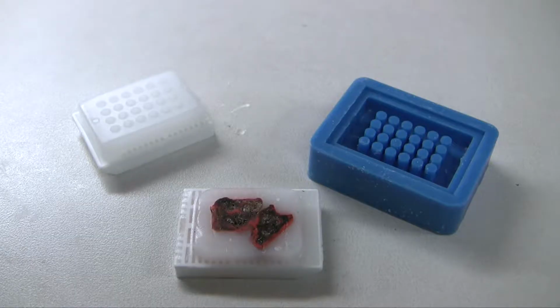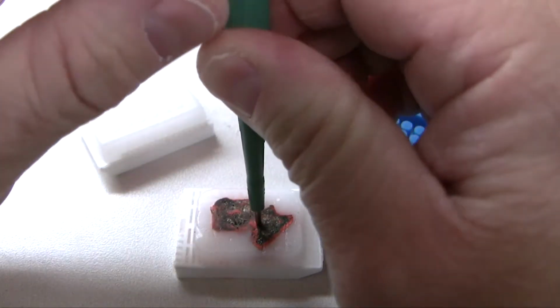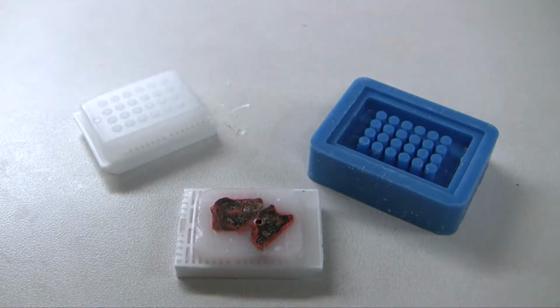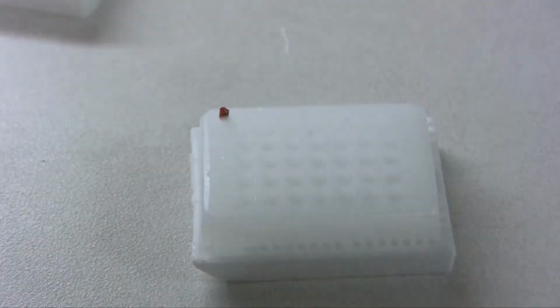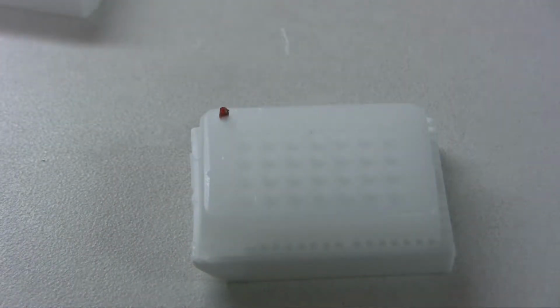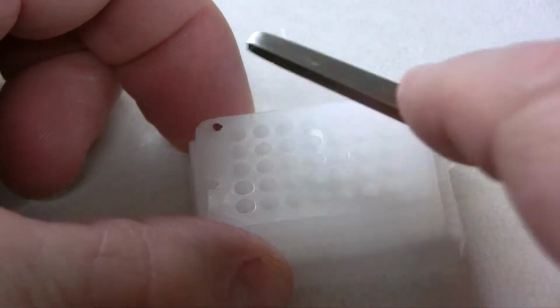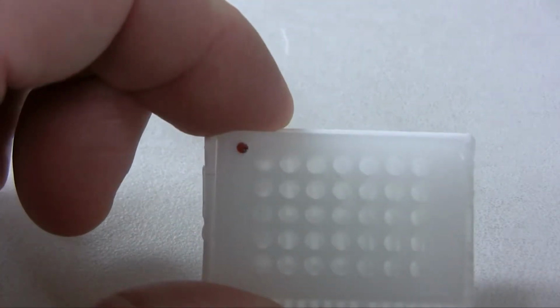I keep my TMA blocks at room temperature or slightly warmer when I'm constructing them. Use the 1.5mm needle to punch your location marker. As you can see, the core is a little snug. Use the backside of a pair of forceps to push the core into the hole. That's a good block. Now I can start my TMA.